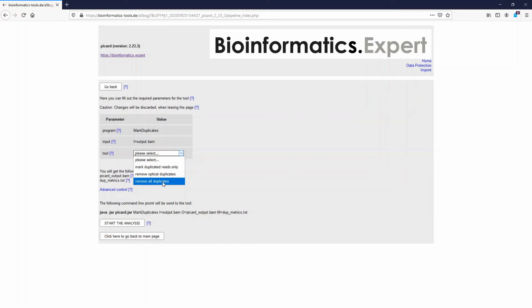However, when we have an experiment in which the output consists of peaks which are located in distinct genomic regions, then we cannot be sure if the duplicated read is a PCR artifact or part of the result. That means when we remove all duplicated reads, that high peaks might lose some of their intensity. That is why I don't like this option very much. However, you can of course decide by yourself and you can use each parameter as you wish.